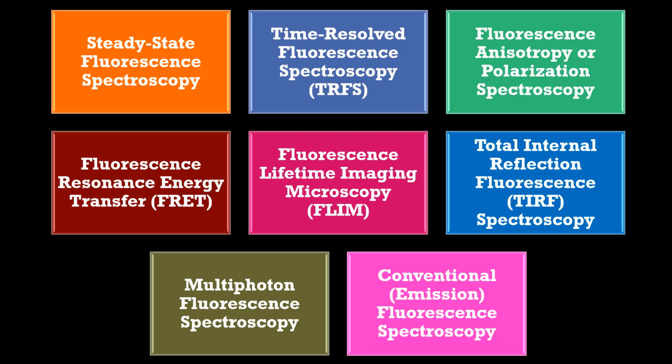Fluorescence spectroscopy can be classified into several types based on different techniques and applications. These types enable a range of studies from basic fluorescence properties to complex molecular interactions.